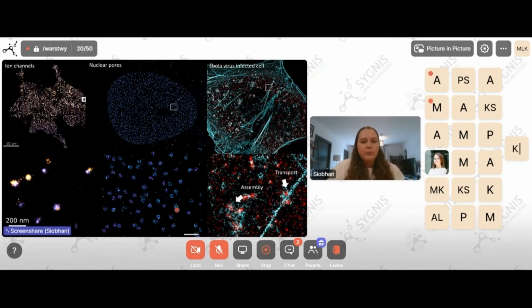So we need these powerful super-resolution techniques in order to visualize single nuclear pore complexes. However, you can actually see in the blue signal here that these nuclear pore complexes are formed of 8 subunits. Using super-resolution techniques, we can see the spatial distribution and count how many subunits are on the nuclear pore complexes. And again, for this level of detail, you really need super-resolution techniques in order to characterize and visualize these single nuclear pore complexes.